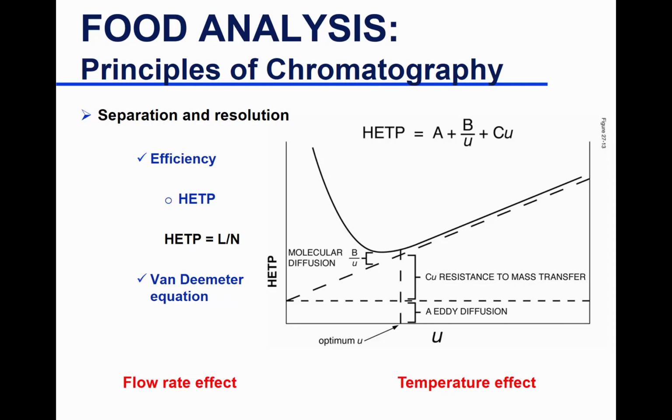That is longitudinal diffusion. But at the same time, you have your mobile phase going. So the mobile phase is going to go by, and then your solute is going to go in and out, as well as going from concentrated to less concentrated down the column. Okay? So if you have a very low flow rate, then the movement is going to go more longitudinally rather than going in and out and going down. You want it to go in and out and reach equilibrium. That's how you get better resolution.